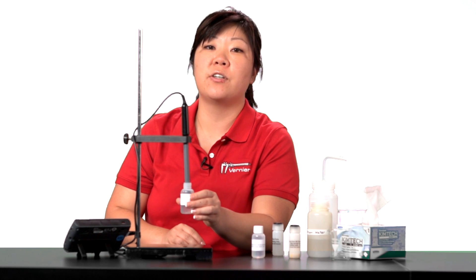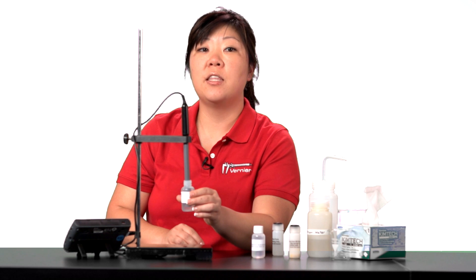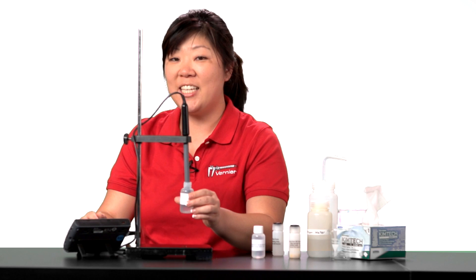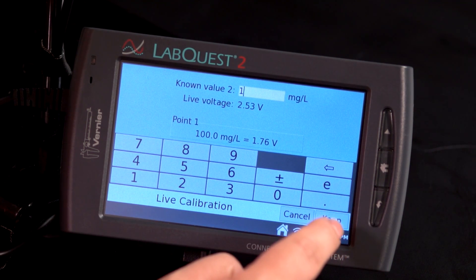Wait 60 seconds for your sensor to equilibrate. In the Value 2 box, enter the low standard sample's concentration. For the nitrate ISE, this is 1 milligram per liter. Then tap on Keep.